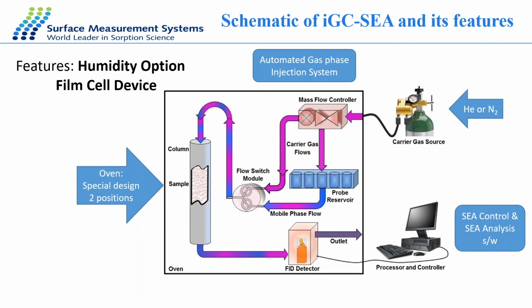It's very important to know how the humidity, how the humid environment, can affect the surface energy or the surface area, because there's humidity everywhere during production, during storage, or during the application of the solids. And how this humidity could affect the surface properties is important to know.